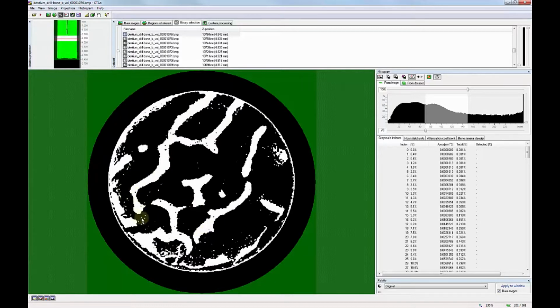Now you'll see we have some noise which we'll need to clean up, but the strange artifact you'll see is this ring that surrounds our whole data set. So where is this coming from? Well, that's an example of the partial volume effect in play. Basically, these pixels near the edge of the image are showing up bright enough to be segmented as bone, even though it's just air and marrow space there. And this is arising from the intensity of the absorption of the metal drill on the outside here.